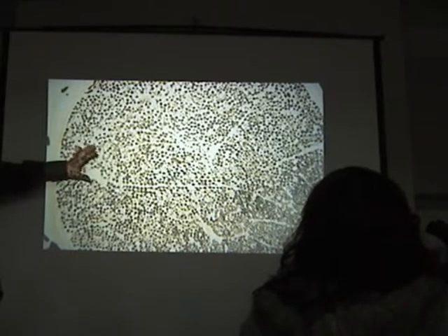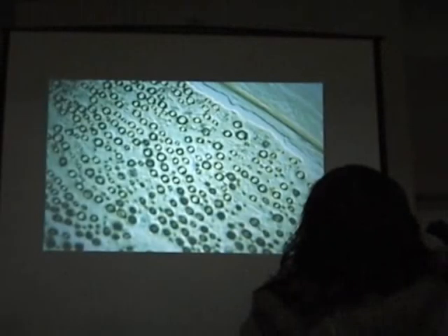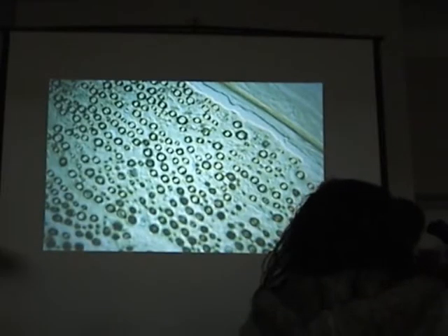Okay. So keep in mind, what you see is dependent on how you fix it. That's why I took the time to talk about how you prepare these tissues on the very first lecture. Here's a higher power, and actually, this is poor. We're going to use our own research material in succeeding years.